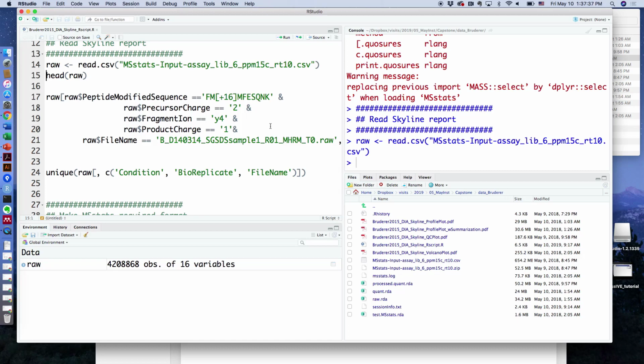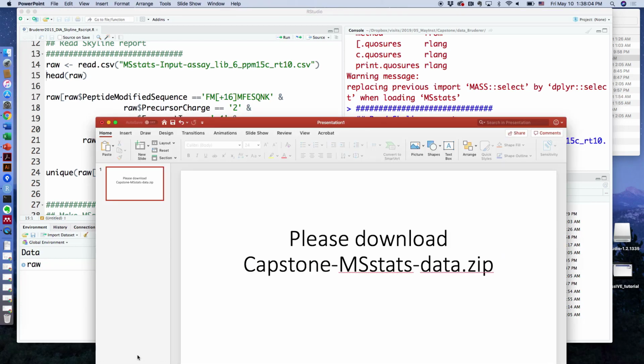Sorry, are more processors critical, or the memory, the RAM? Actually, there is one hidden option, cluster, for data processing and testing. If you increase the number of clusters, it can speed things up a lot. However, we have not heavily tested how it works, so there can potentially be issues, but we still have some issues. Oh, maybe okay, it's running.